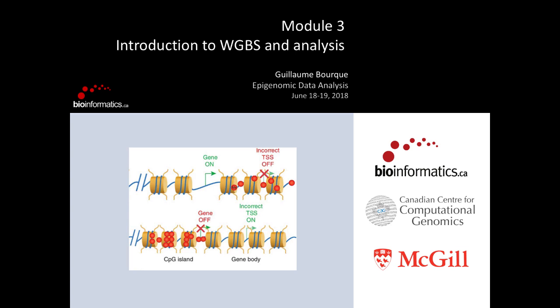As Anne mentioned, yesterday was really about ChIP-seq analysis. So we went into the ins and outs of how to do those types of analysis. This morning, both my module and my lab are really about how to analyze methylation data. The practical is going to be on whole genome bisulfite sequencing. But in the introduction, I'll talk about other assays to measure methylation. So let's go right into it.